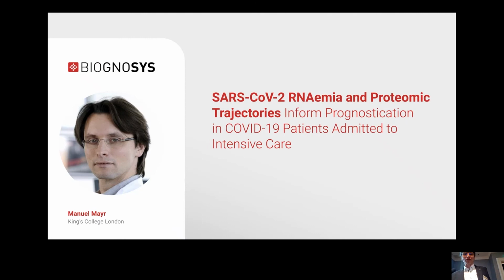Thank you, Sebastian. I have the pleasure to talk to you about our work on COVID-19, which started almost exactly 2 years ago, during the first wave of the pandemic in the UK. And I will show you how we compared protein biomarkers against RNA biomarkers, in this case, RNAemia.